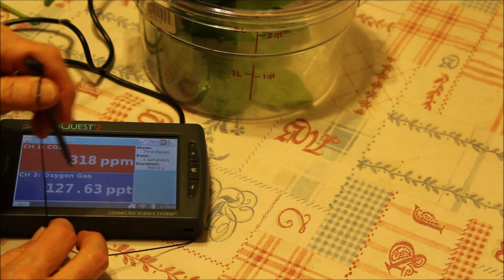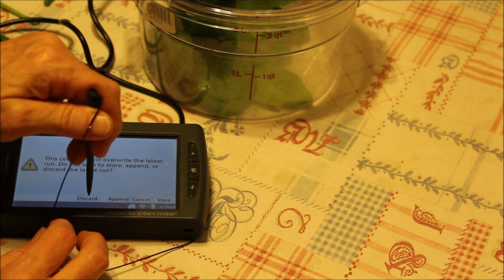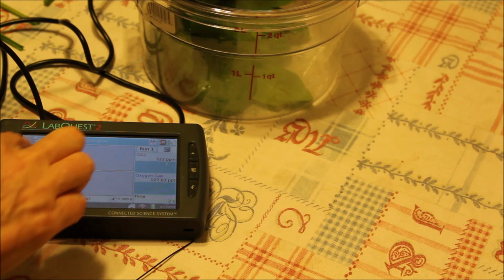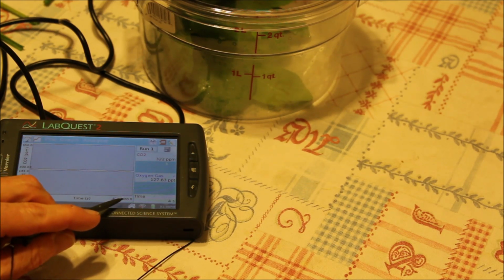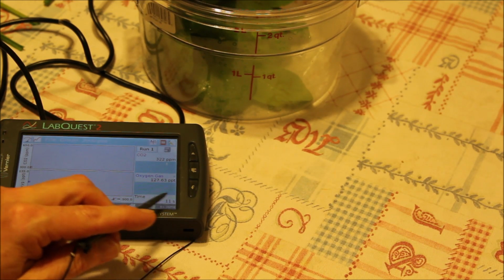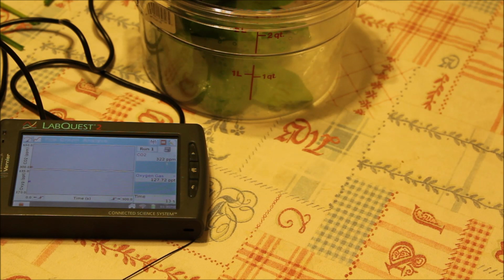Discard, because I saved that already. And it's going to now measure for 900 seconds. It's playing now, and this is the time that it starts to measure. Now in my house I have to turn off the light or make it a little bit dim, but it will be totally fine. So that's what you will do now.